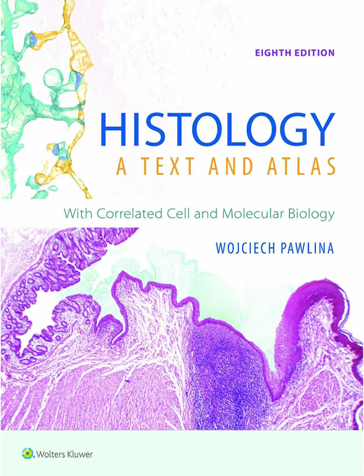Potentially down to molecular or even near atomic resolution in some cases. And a huge advantage, especially for biology, is that AFM doesn't require a vacuum like EM does. It can image specimens, even living cells, in their natural aqueous environment under physiological conditions. Feeling living cells. That's remarkable. So there you have it.